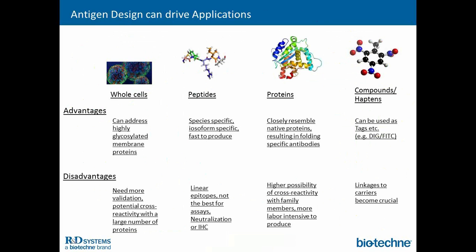As peptides usually are more linear, presenting linear epitopes, once you're switching from your recombinant protein or your more artificial system into a final product on an ELISA assay, you will encounter that many antibodies based on peptides will not recognize the native protein and therefore will not give you what we call an assay-grade antibody. And you will lose sensitivity at best. In some cases, you will lose specificity as well, and you will just not get the final desired outcome that you're interested in.